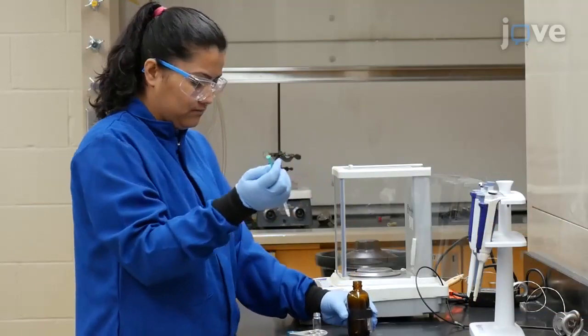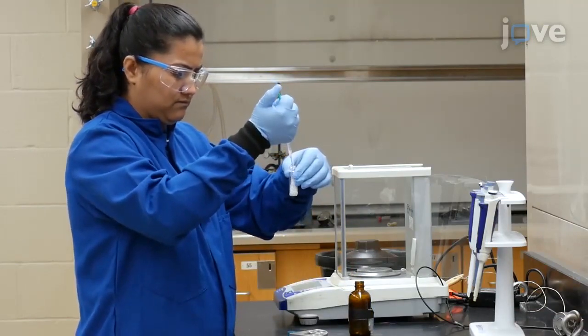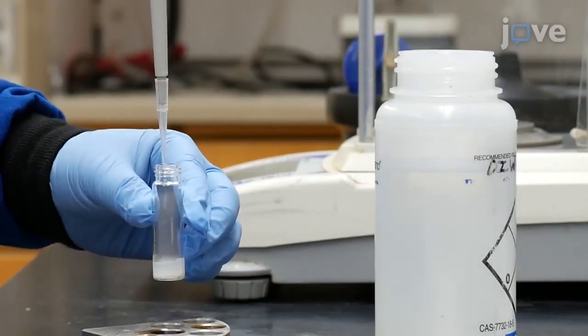Then add 1 milliliter of acetic acid and 21.7 microliters of deionized water to the vial.